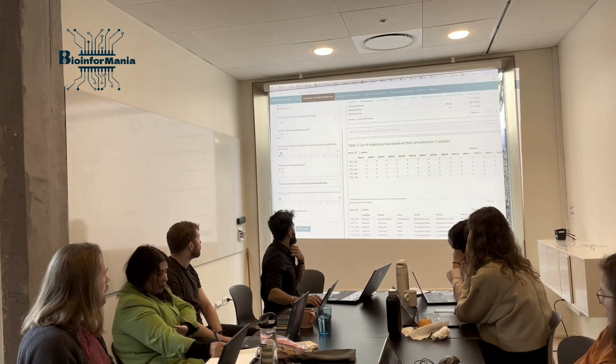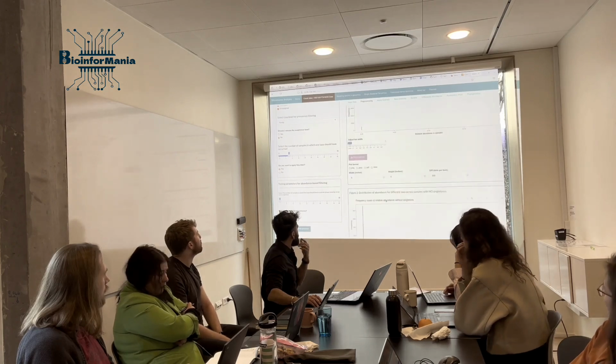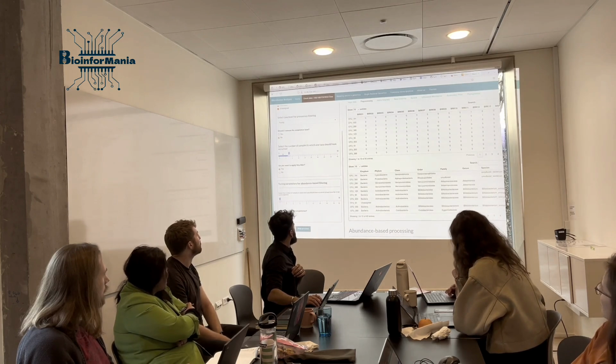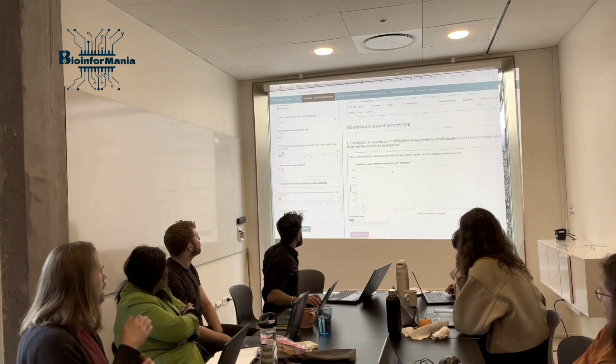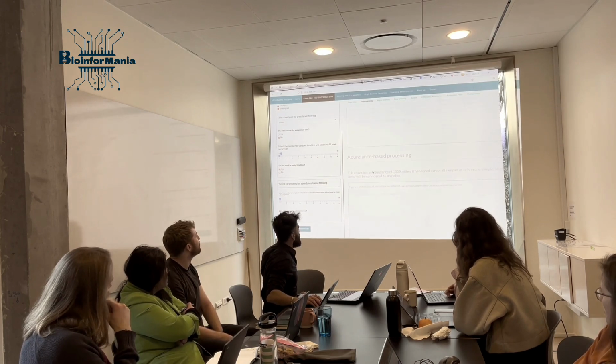And with this criterion, it found 5 of them. If you increase this, it might go for really a lot. If I increase this criterion, it found 40. I don't want to do that because I don't have that many samples per group, okay? So I just stick to the default, 1, and then select yes, I want to remove it.